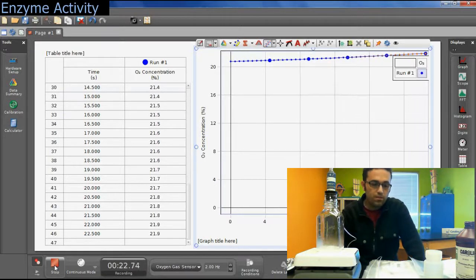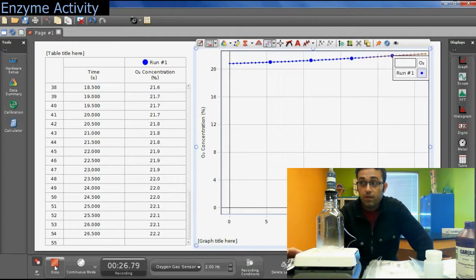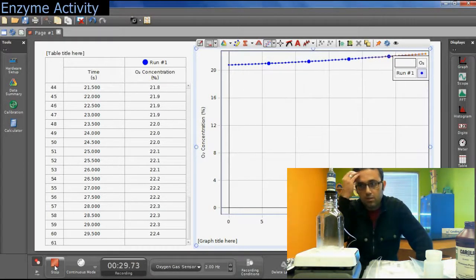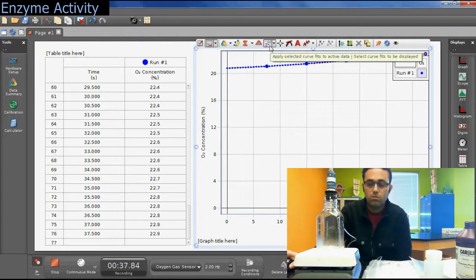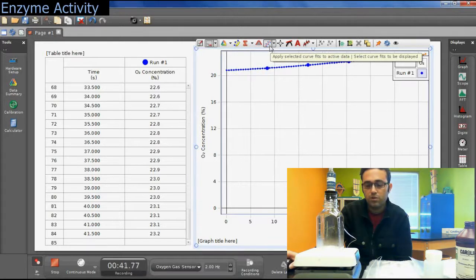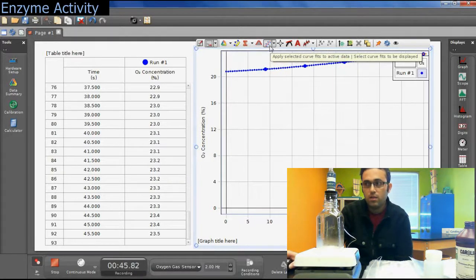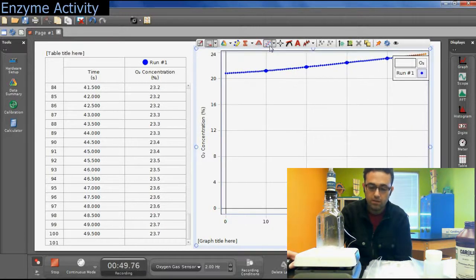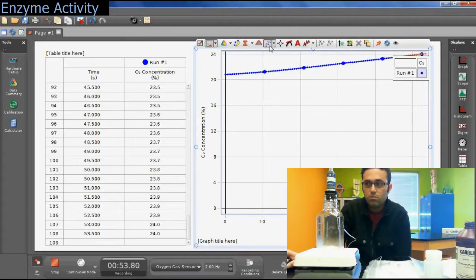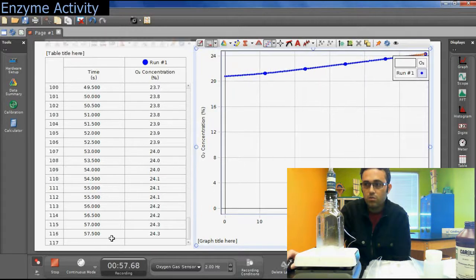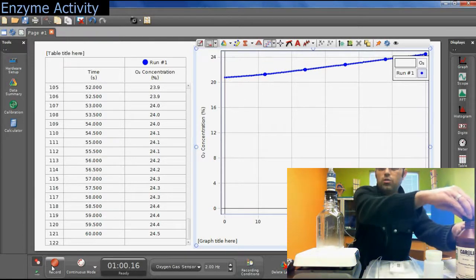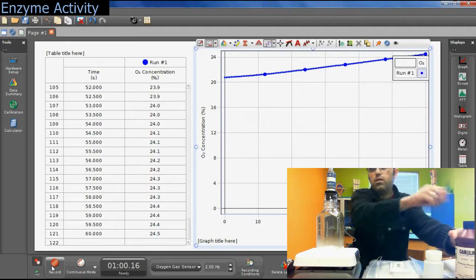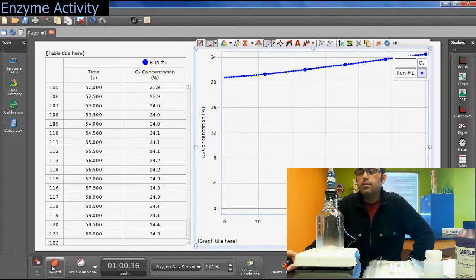After 1 minute I will stop data collection and use this feature to calculate the rate of the reaction. But what I want you to do is get the best fit line and calculate it by hand. The software will calculate it for you easily, but it won't calculate it for you on the exam. So once you get your graph and best fit line from the software, make your calculations using your own graph.